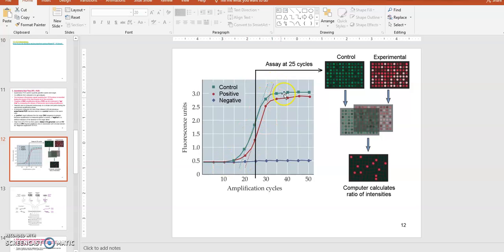Okay, so that speed can be compared with another tube that has another PCR setup. The difference between the control PCRs, positive and negative: the negative PCR would not have the template DNA added, right?